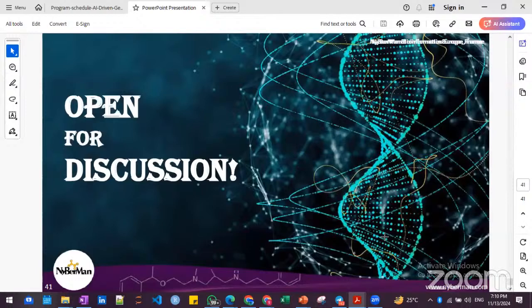Yeah, that's why I was mentioning that programming is an additional bonus point for you. When we work in Linux and write programs, there are some tools which give very proper instructions that this is the error, for example, the flow cell number is missing in your data, in your FASTQ file.